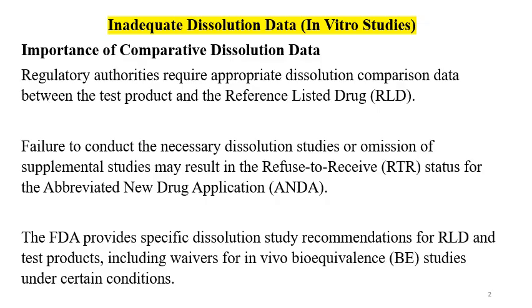For the US market, it is called the RLD. Also, the dissolution comparison is to be done in multimedia, and dissolution testing is required to be performed on all the strengths of the formulation.